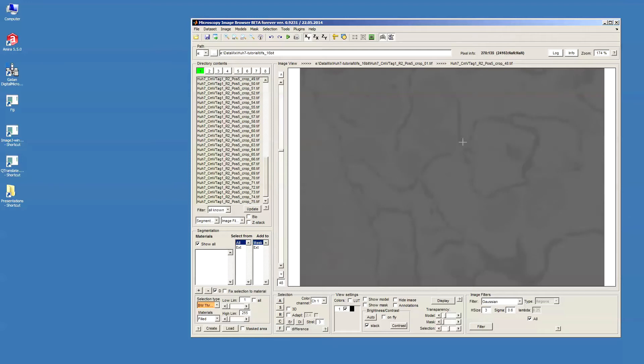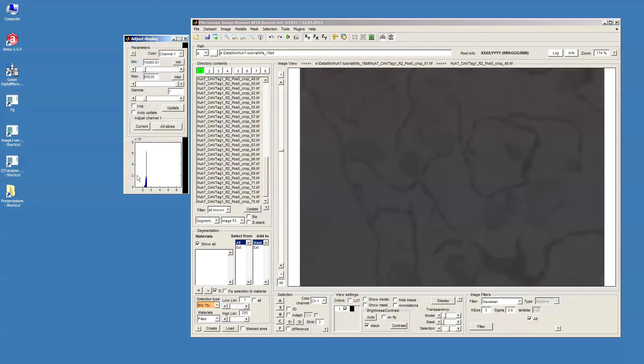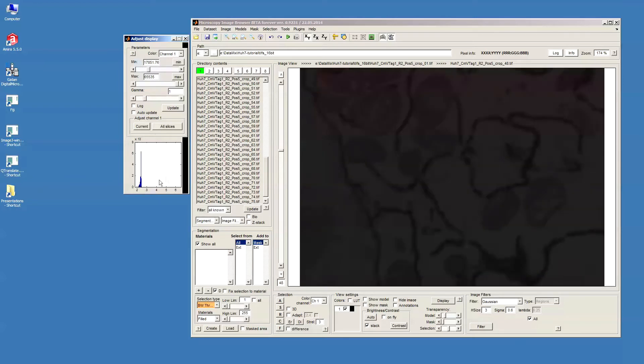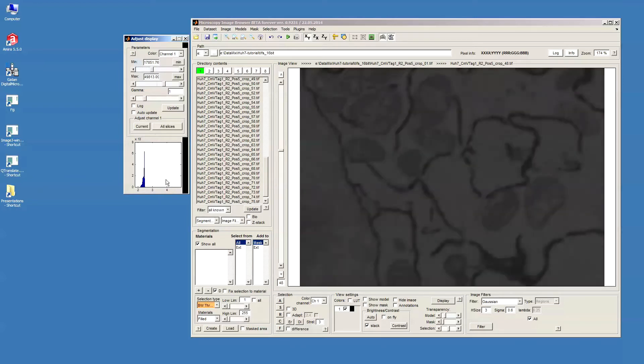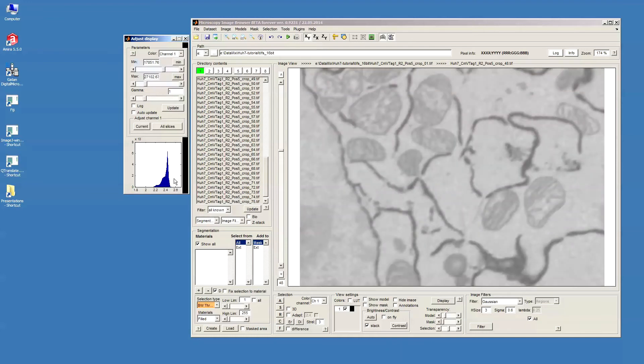Now the data looks quite grey because it was taken in 16-bit format and the actual intensities are not stretched through the whole intensity range. In order to stretch the data, we need to press the display button. Using the left key we can change the minimum value, the minimum intensity value, and using the right key we can change the maximum intensity value.